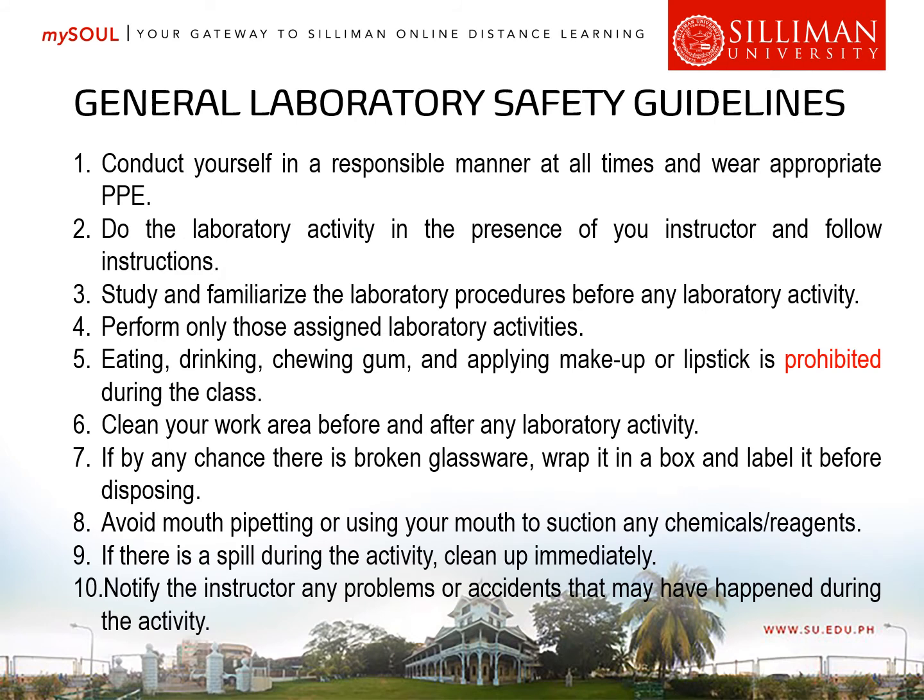These are the general laboratory safety guidelines that a laboratory staff should follow when working inside the laboratory. So first, we have conduct yourself in a responsible manner at all times and wear appropriate PPE. So again, you're not allowed to process patient specimens if you're not wearing your complete personal protective equipment.